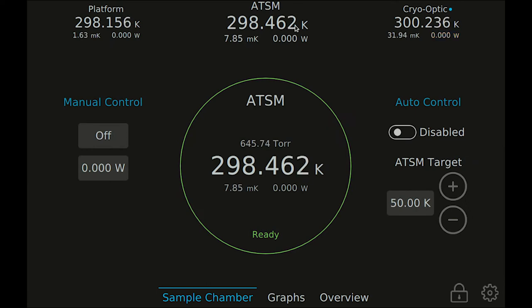The ATSM is fully controllable by the user manually and is not automatically controlled by the system. You can apply heat manually to the ATSM by setting the heater power manually, or you can set a target temperature and enable the PID controller to hold the ATSM at a temperature setpoint. When the PID controller is enabled, you will see a blue dot next to the ATSM label at the top of the screen, to show you at a glance whether or not the ATSM PID controller is enabled.